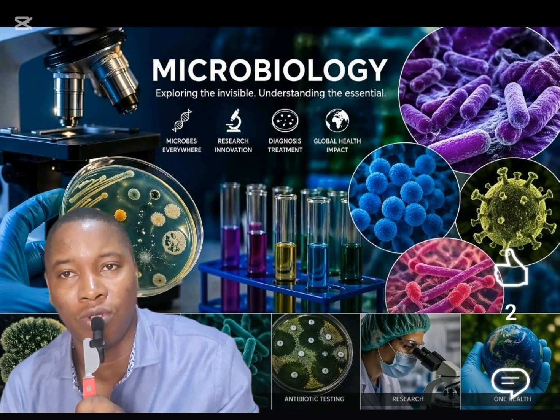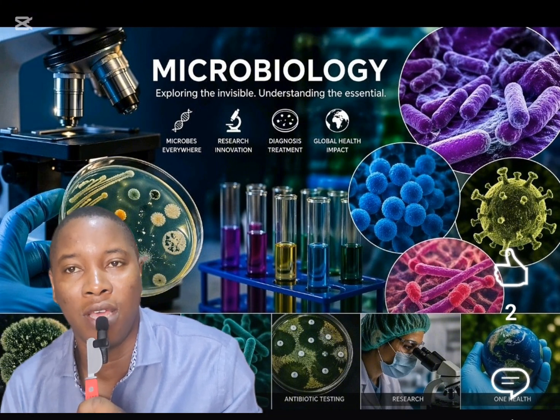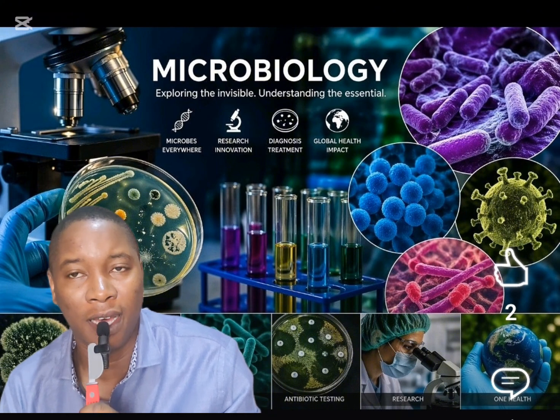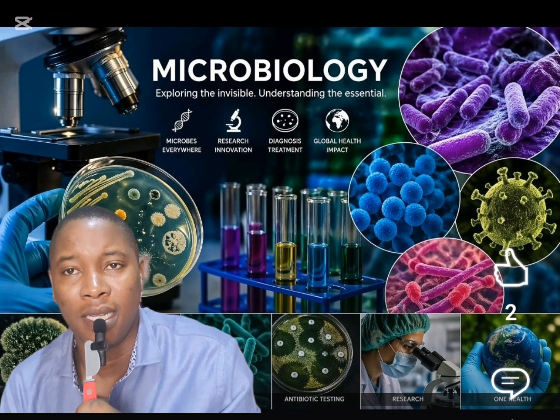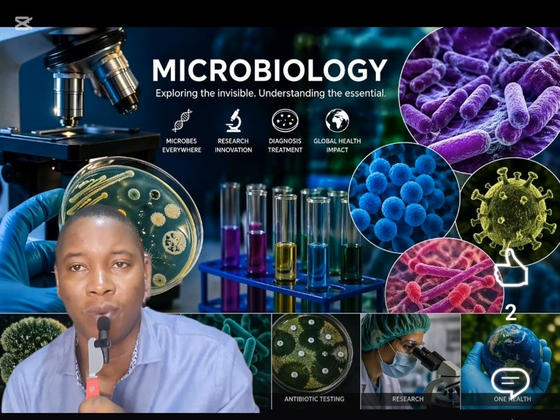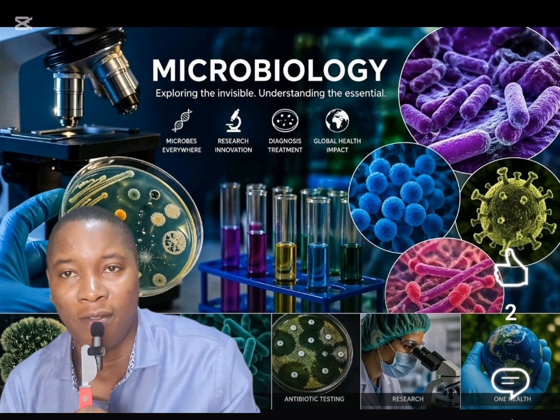And so, in order to do that, we use what we call a McFarland standard, which is a pre-prepared one you can buy, where you compare the turbidity of your own bacterial suspension with that turbidity, with the belief, using your eye, that's an eye test, that if they are roughly the same in terms of turbidity, then it means that you have roughly the same amount of bacterial cells in all of your solutions. We usually believe that it's about 1.5 times 10 raised to the power 8 colony forming units of bacteria that is present when you standardize using your McFarland standard.